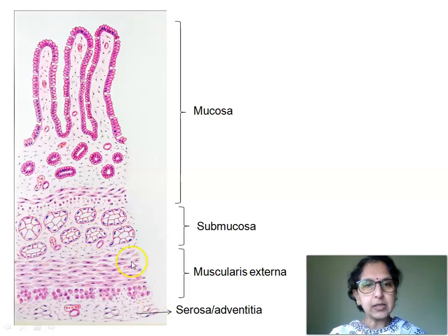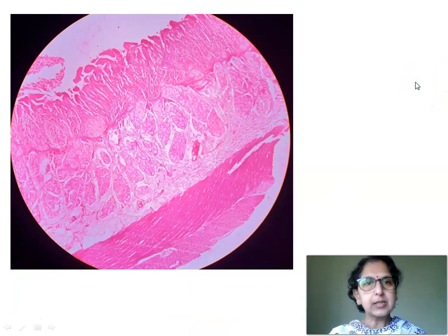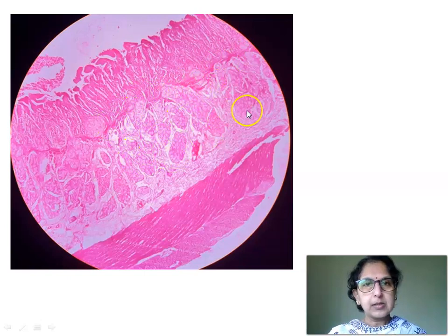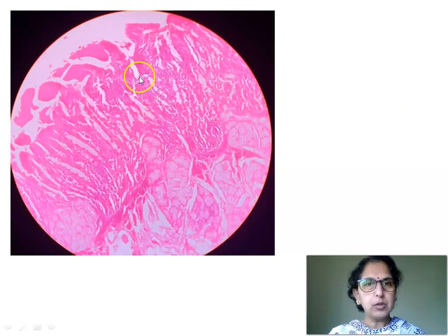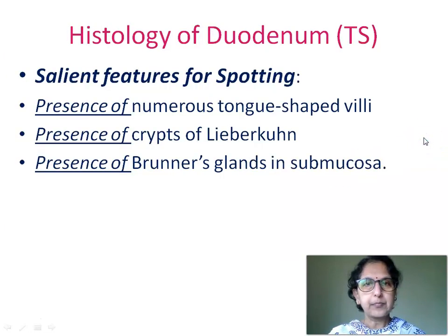Muscularis externa showing inner circular and outer longitudinal layers, and finally the serosa or adventitia. The H&E stain slide — low power view — showed tongue-shaped villi, muscularis mucosae, submucosa with Brunner's glands, muscularis externa, and serosa or adventitia. A high power view showed the tongue-shaped villi and Brunner's glands in the submucosa. The salient features for spotting a slide of histology of duodenum transverse section were: presence of numerous tongue-shaped villi, crypts of Lieberkühn, and Brunner's glands in the submucosa.